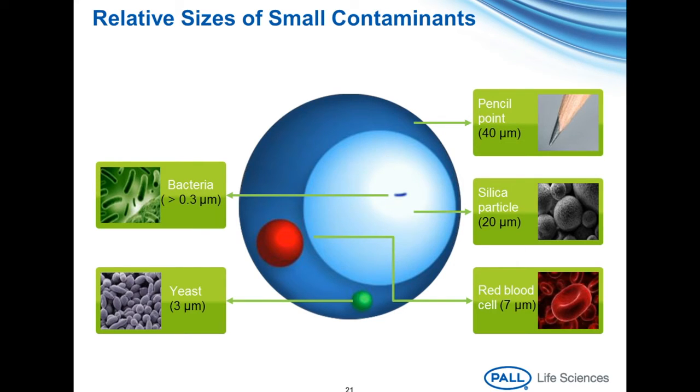What I'd like to highlight and what you should note is that the bacteria, shown on this screen, is at a size of 0.3 micron, or 300 nanometers. We should think of size range in nanometers when we talk about anything microfluidized, and you'll see why I'm pointing this out in a slide further on.